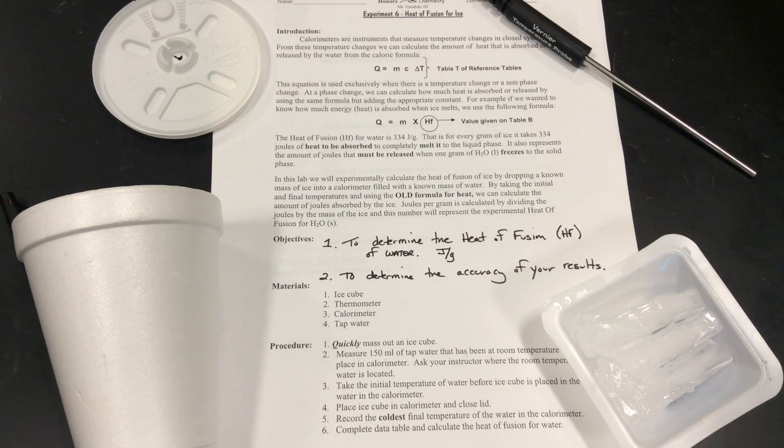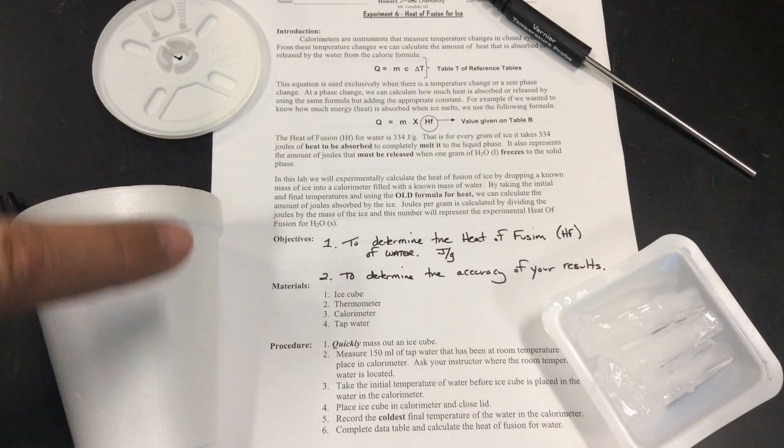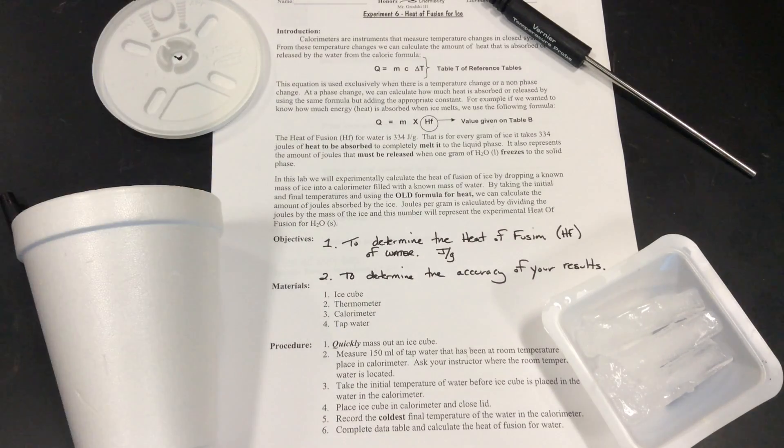We want to measure this through calorimetry. What I have here is what I call a NASA-grade calorimeter. Even though it looks like a coffee cup and a lid, we call it a NASA-grade calorimeter because all it is is a very simple styrofoam cup and lid.